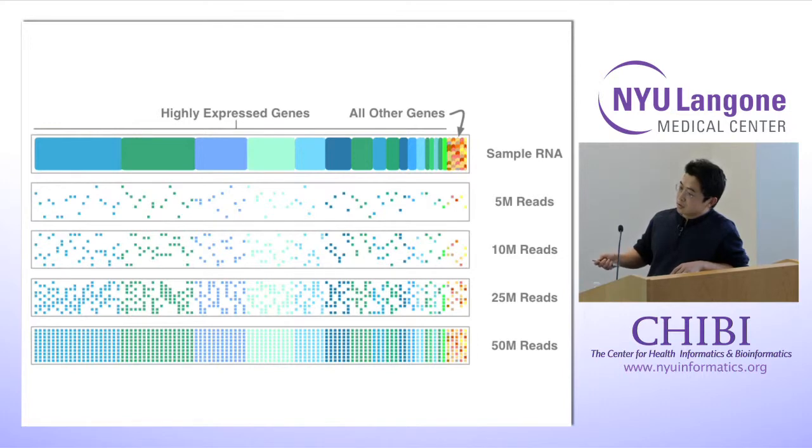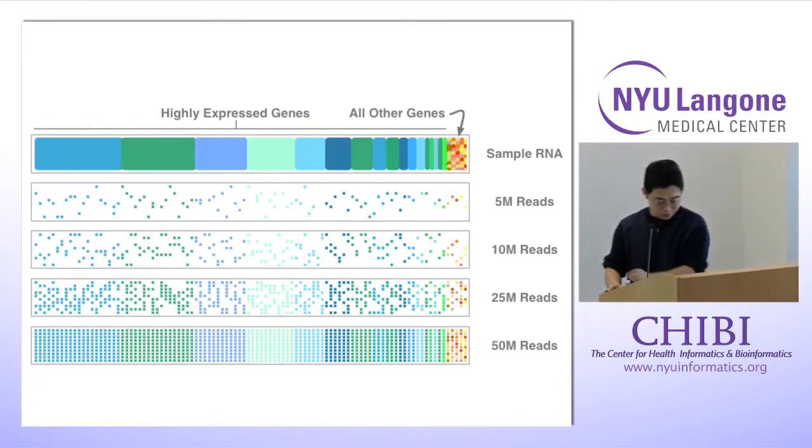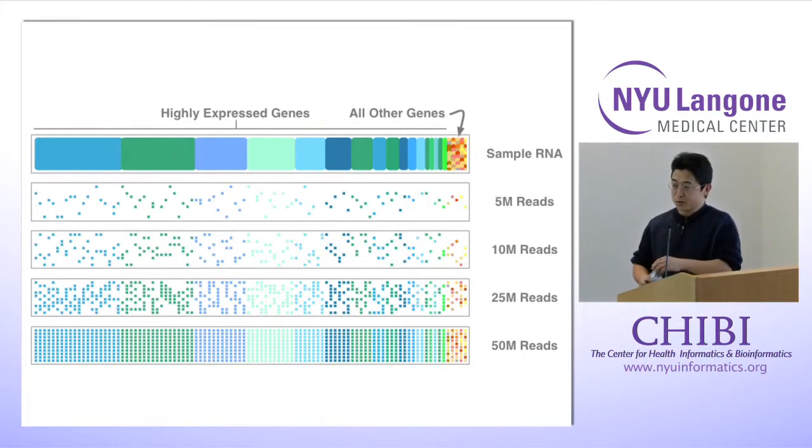When you change the number of reads you can get from the transcriptome, you will see some differences. This is just a cartoon, it doesn't carry any more meaning.